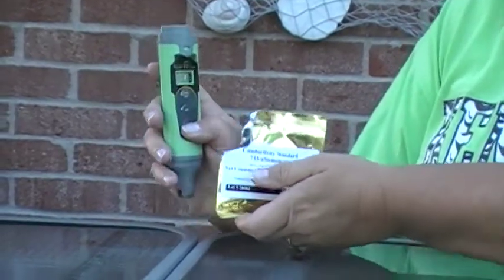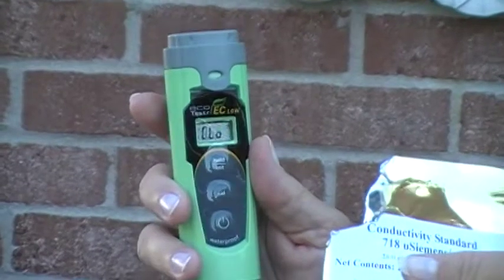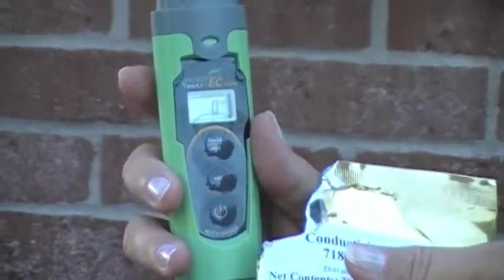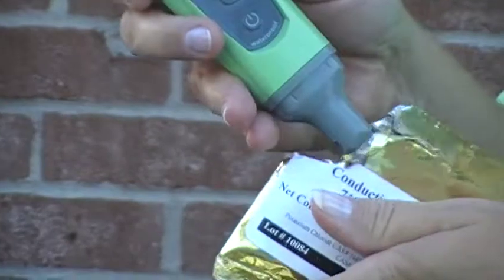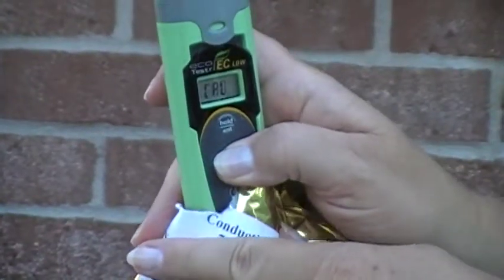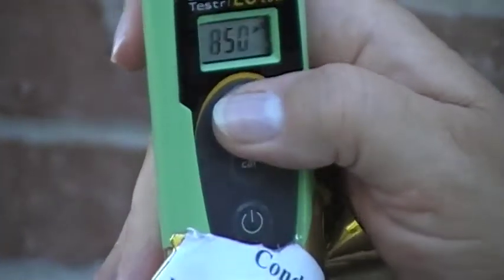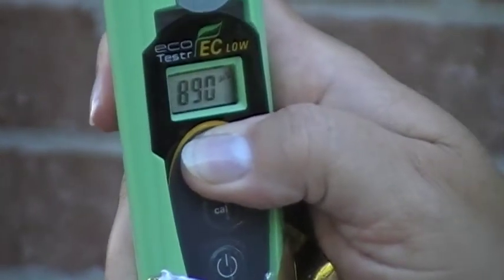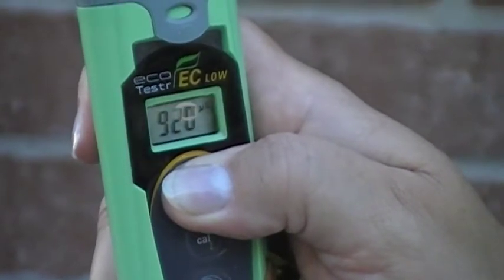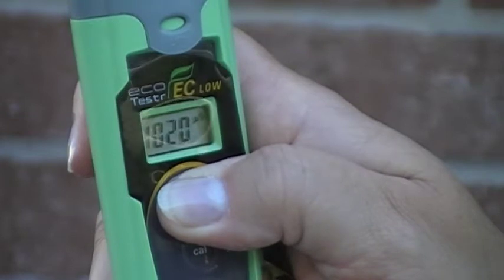So we're going to calibrate to 720. Turn your meter on and let it go to zero. Put it in the solution. Push and hold the CAL button. Once it goes to the numbers, move to the top button and hold it in. If you go past 720, don't worry — it will scroll back around.